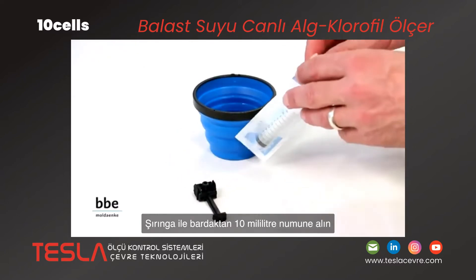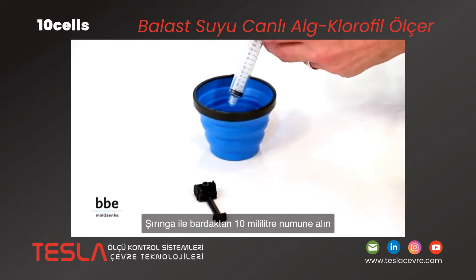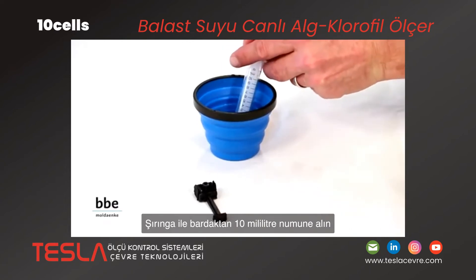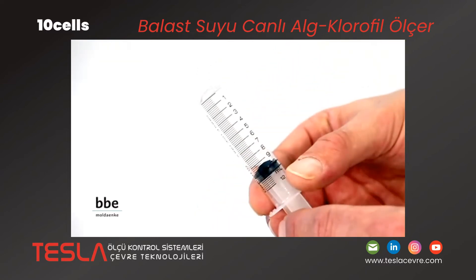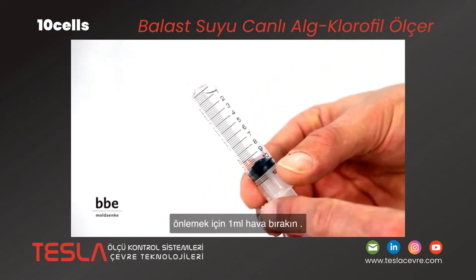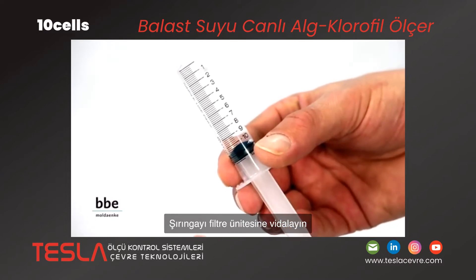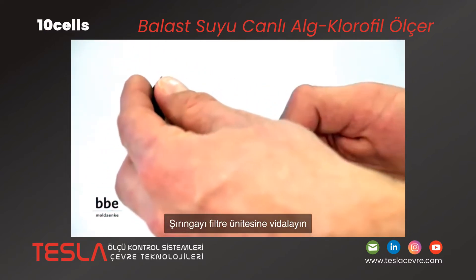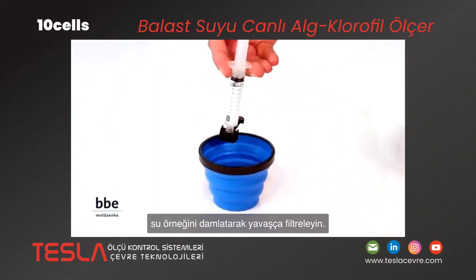Using the syringe, take a 10 milliliter sample from the cup. Additionally, leave one milliliter of air to avoid dead volume during the filtering. Screw the syringe onto the filter unit and filter the water sample slowly by dripping.